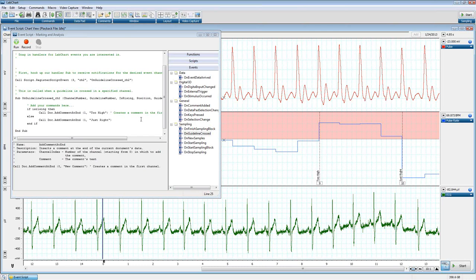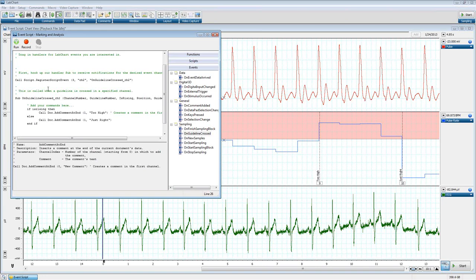it will automatically analyze our data after we're done recording. Okay. So we're going to add a couple things in here. The first thing I wanted to do is a multiple add to data pad. It's going to analyze our entire file when it's done recording, and then we are going to open the data pad and then show it. Okay, so we're going to do a few things here.